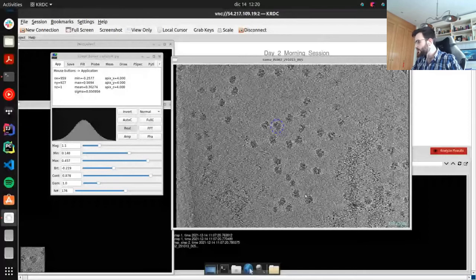On Mac, control left click is not working for the negatives. I don't know if Mac changes the key. Probably the option key might work. I don't know how it works on Mac. I don't know if someone has a Mac and can help.